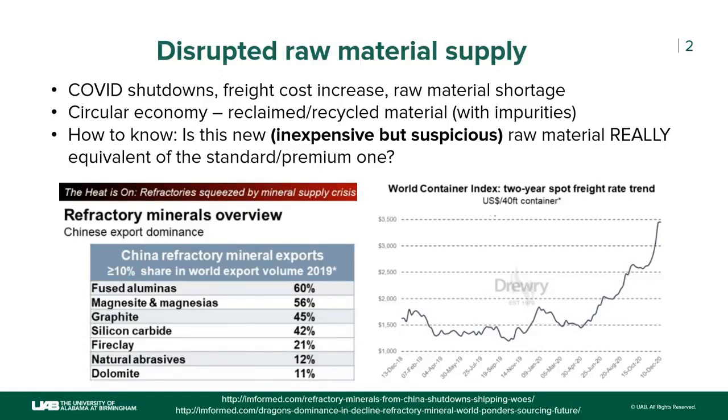So let's say you have an impure clay or an impure bauxite, it has certain impurities. But if you get a used slide gate plate from the steel industry, that has a different set of impurities. And the liquid phase it forms as a result of it is different. So we are facing a situation which is unprecedented.